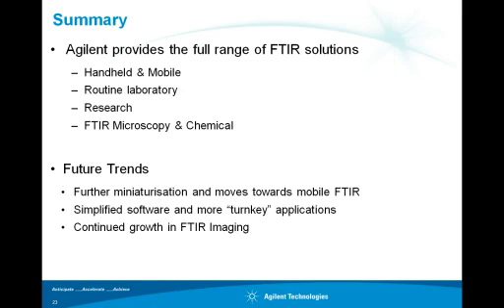And where do we see some of the future trends? Well, I think the trend towards miniaturization will continue, and the move towards more mobile FTIR measurements will continue. Certainly simplified software and more turnkey applications as users become less and less experts. The software will need to cater for that. And I also expect to see continued growth in FTIR imaging.